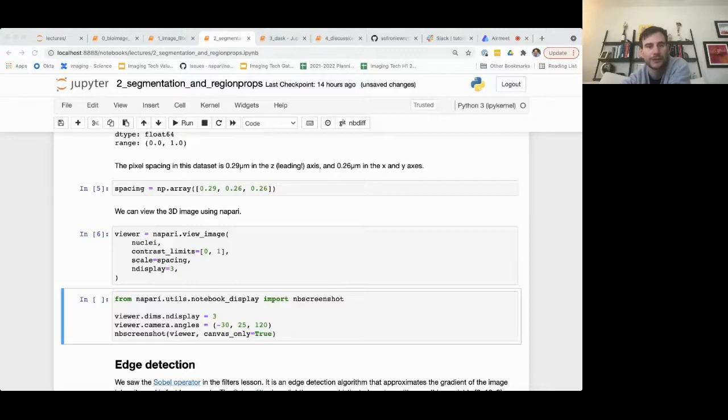I can do things like change color maps. If folks want, you can also adjust contrast limits as well. A lot of the basics that you'd expect from an image processing tool, but one of the nice things is now that it integrates really well with the Jupyter Notebook. And so, you can go and you'll see some examples of bidirectional communication with the notebook as we go.